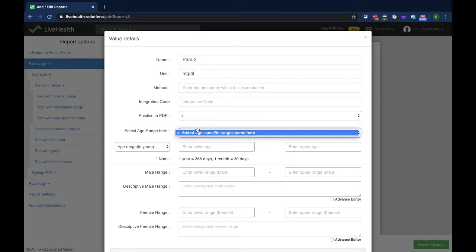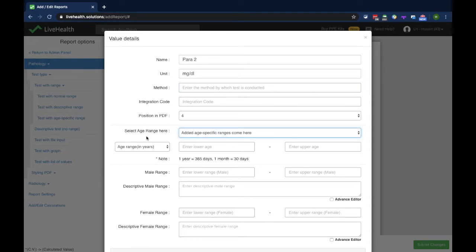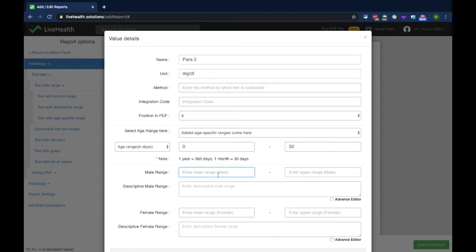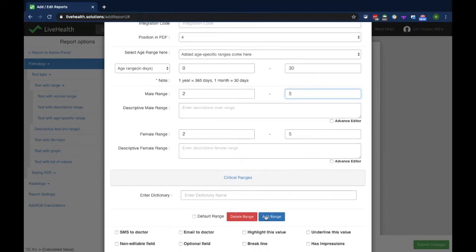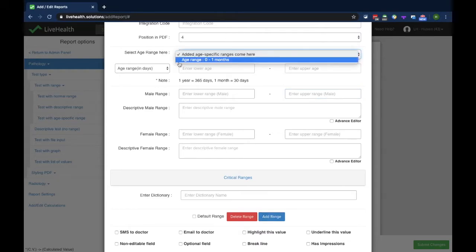The unit is again mg/dL. First I need to enter the age for which I want to enter the range. Suppose I want to add a neonatal range for a newborn baby: I'll select 0 days to 30 days and set the range as 2 to 5. I can change the female range if I want, then click add range — that range for 0 to 30 days is now added.